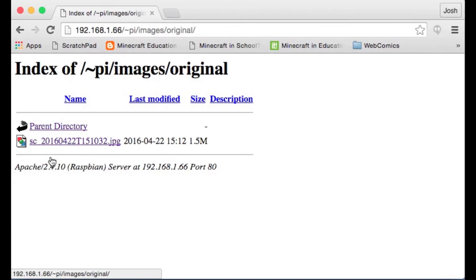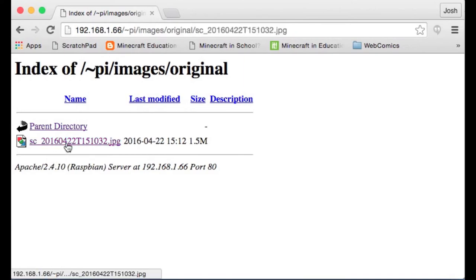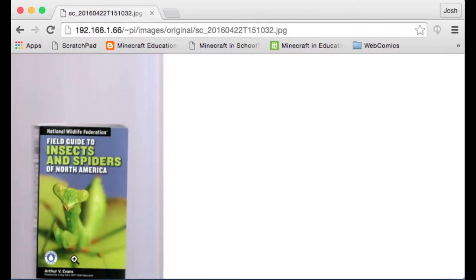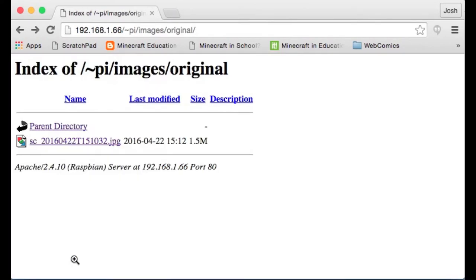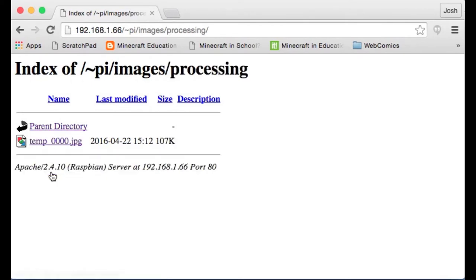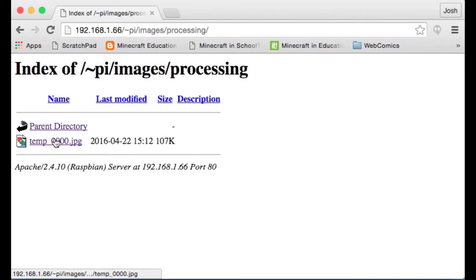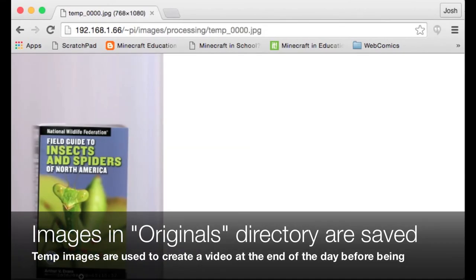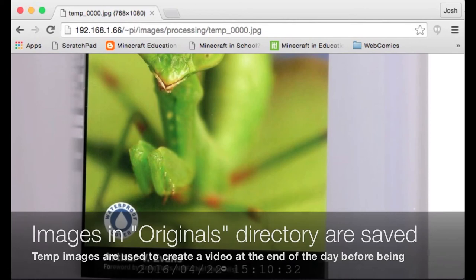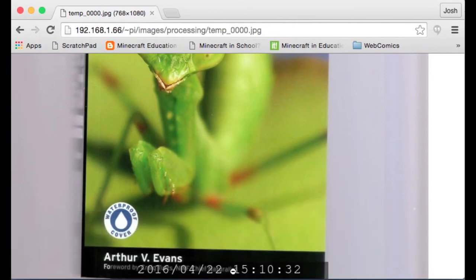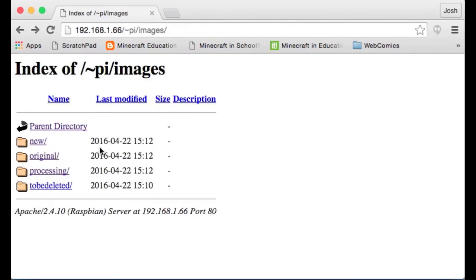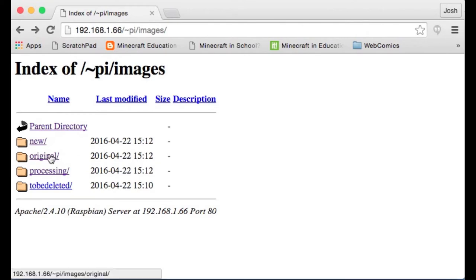Now the original image doesn't have a timestamp on it. So you've got the file name, but it doesn't really help you out if you can't see the file name. If we go to processing, there's this temp file here. This file will eventually be deleted, but if we look at the bottom, you can see a timestamp right there, and that should match the timestamp of the file name and the original. So this is great. We've got an image scanned.